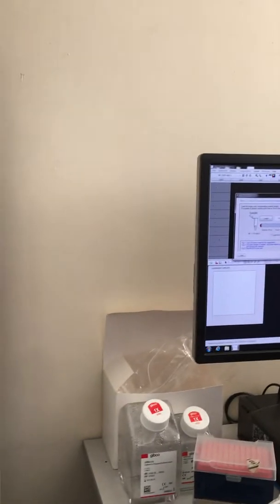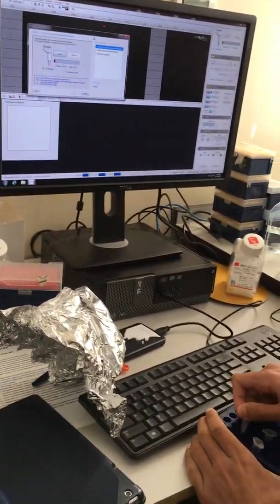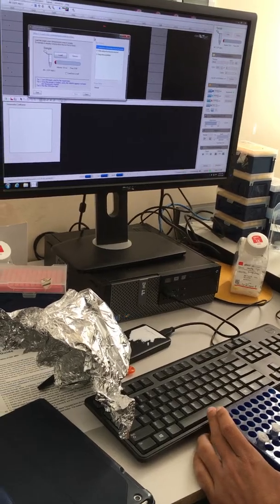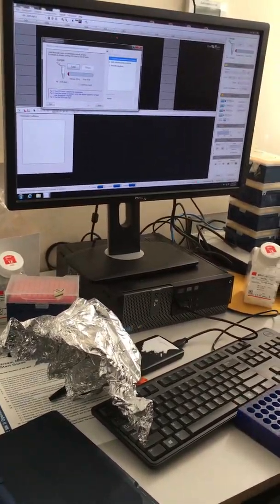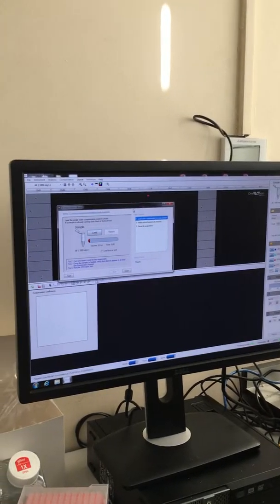Okay, so I choose this. Use that. Go a bit harder than that, otherwise you're going to get clumpy cells. There you go. Cool. So this is compensation live dead. Just open it up and put it in.